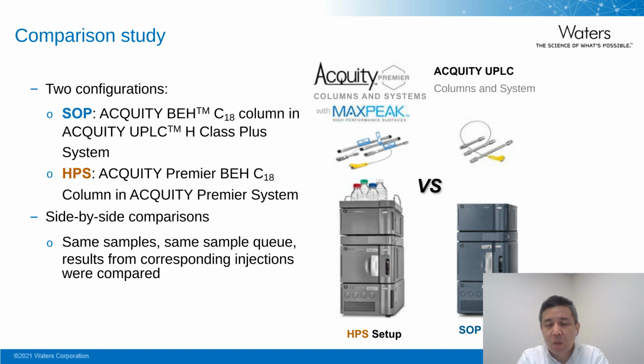Also, for the columns we used, in order to eliminate batch-to-batch variation in the packing materials, the columns are from the same batch of packing materials, so there is no difference in column performance.